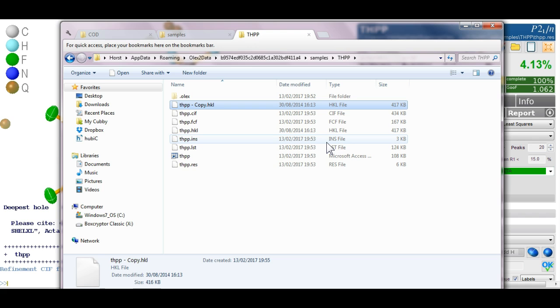So the rule in Olex 2 is that this data set is called THPP and it's going to be called THPP all the way through. So this is one data collection that's got that name and if you reprocess it or if you do different things it's still going to be called THPP. The name is what holds it all together which enables Olex 2 in the end to get you clean data and clean zip files out.